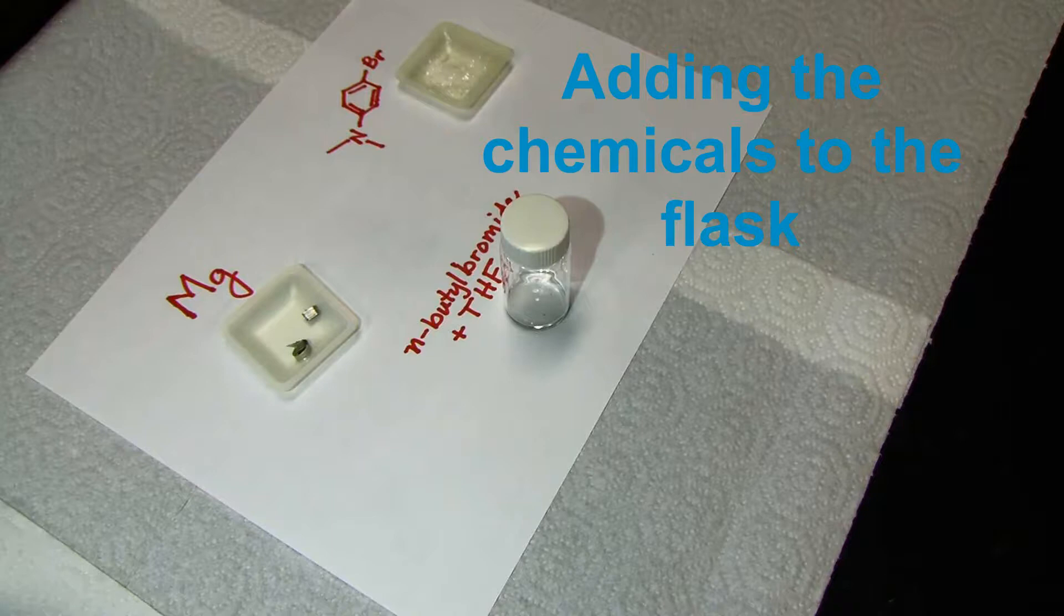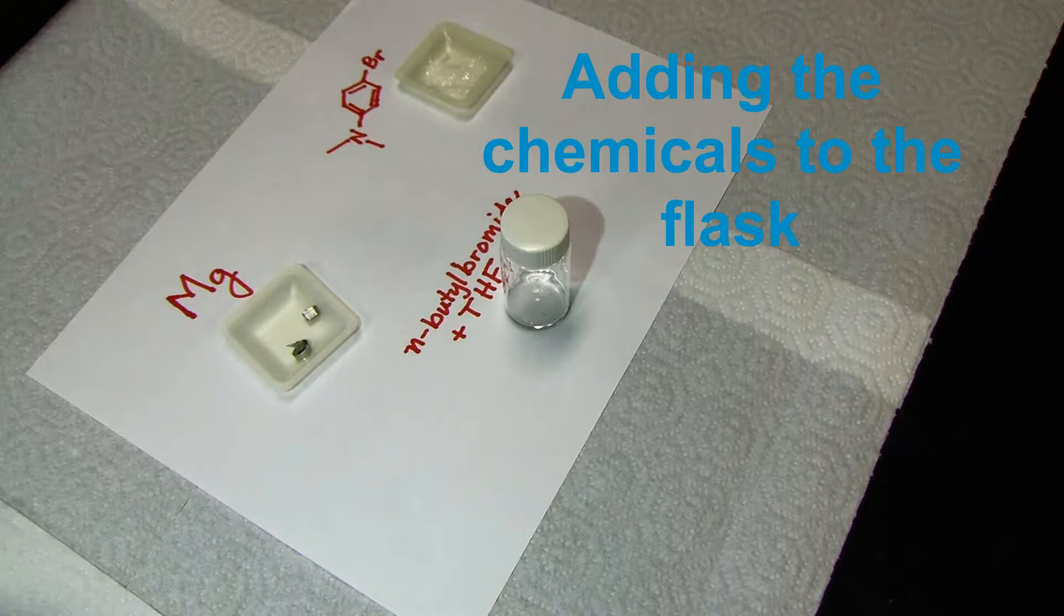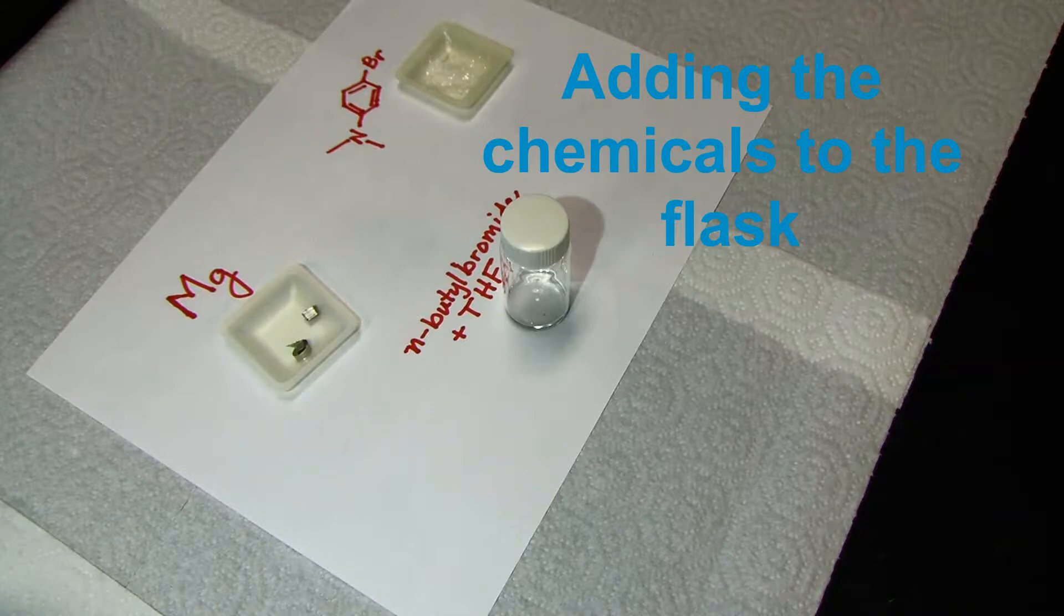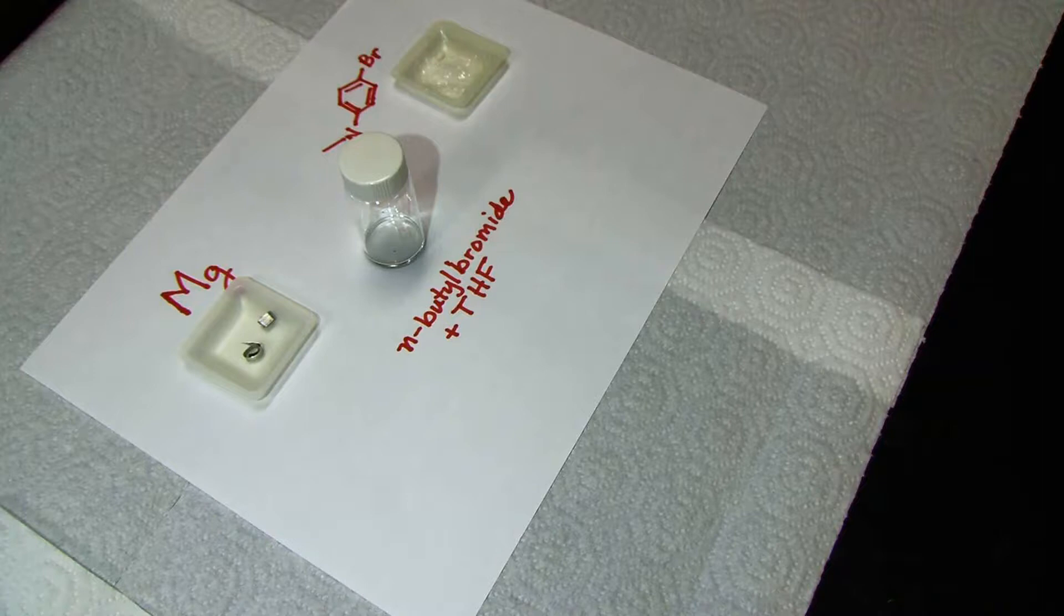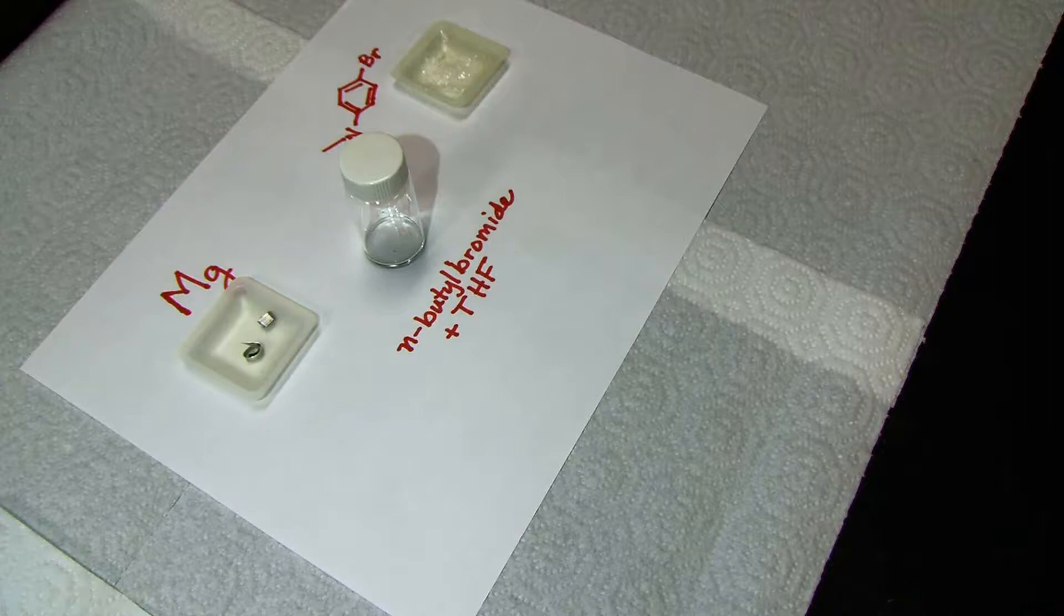We will be setting up the reaction in the fume hood and we'll need to move quickly after opening the apparatus assembly to keep it dry. So I thought I would first go through the steps more slowly. Here are my weighed solids with the magnesium curled up and the glass vial with the n-butyl bromide and THF from the syringes.